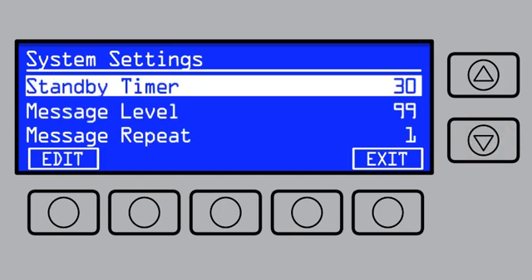The standby timer can be set the same way. Then, when you touch any button, the machine will wake up.